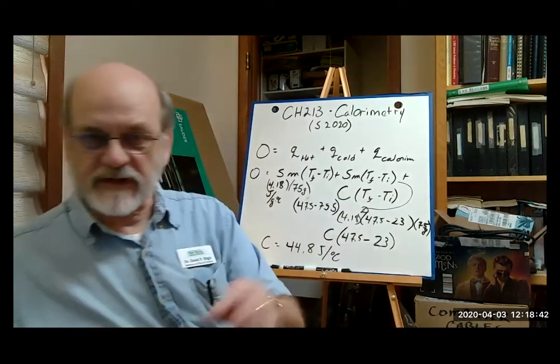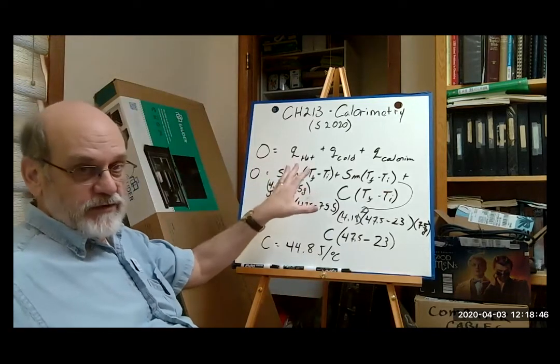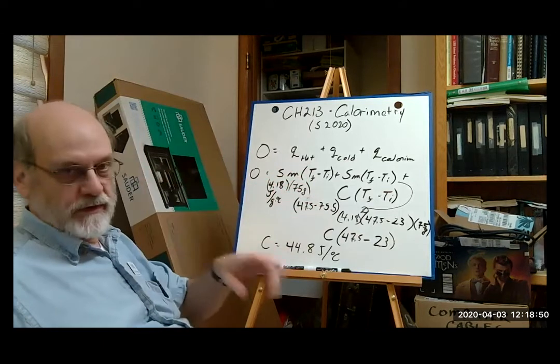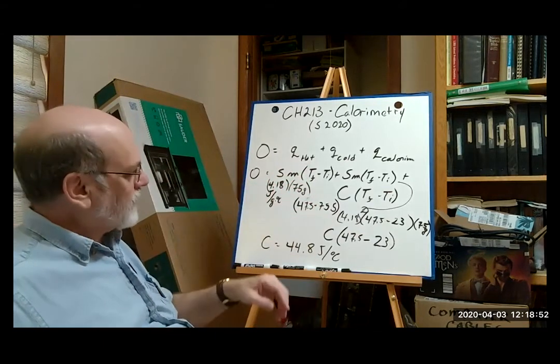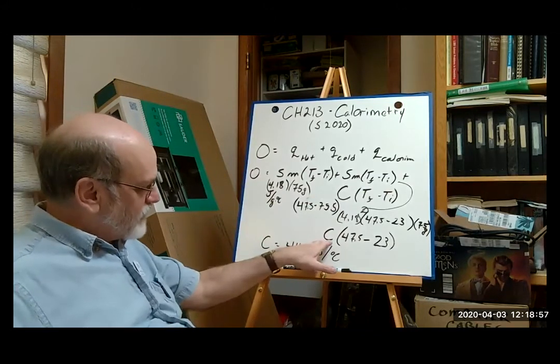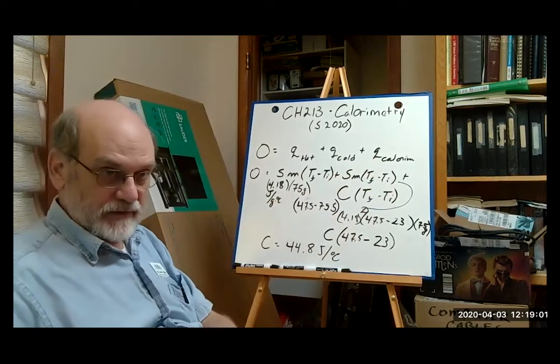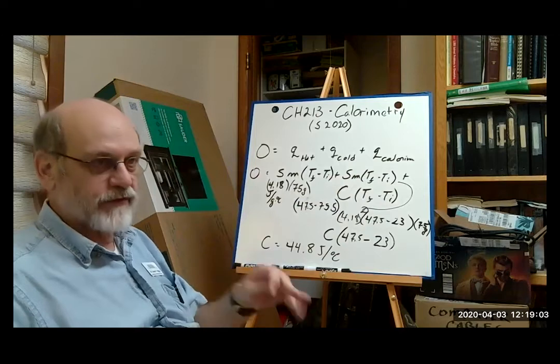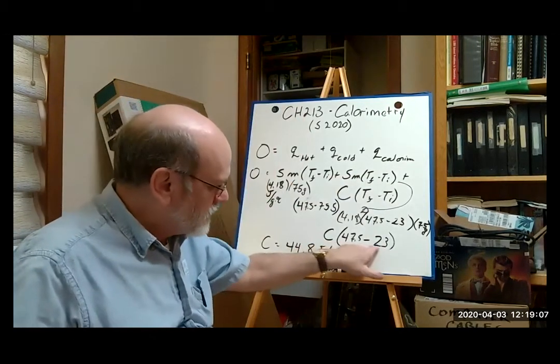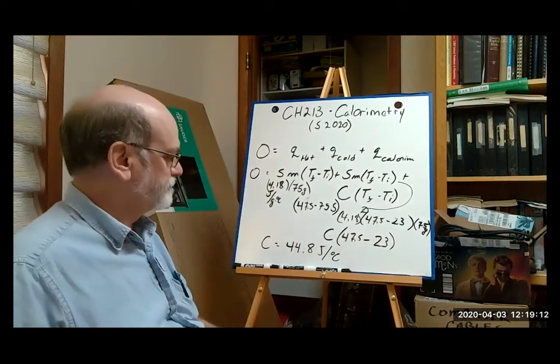So in our subsequent experiments, you're going to be using the calorimeter that you created, theoretically. Remember, you're in the twilight zone. And this value will go into that position for every reaction that you investigate. Parts 1, 2, and 3. The only thing that will change is the temperature change that occurs for that particular experiment.